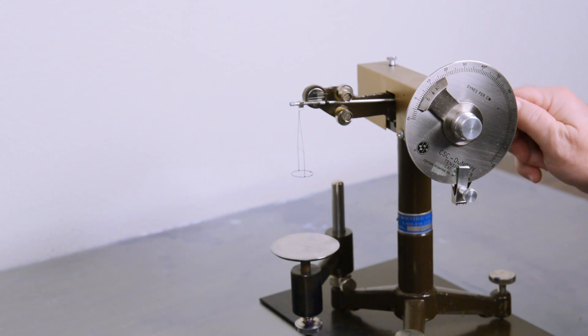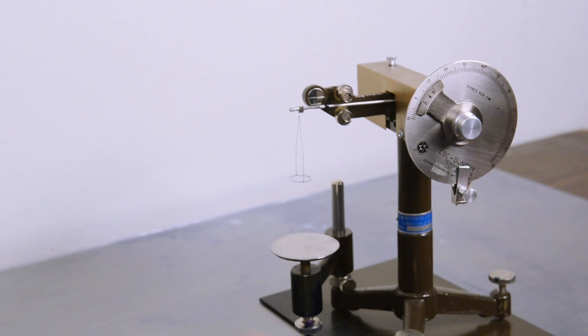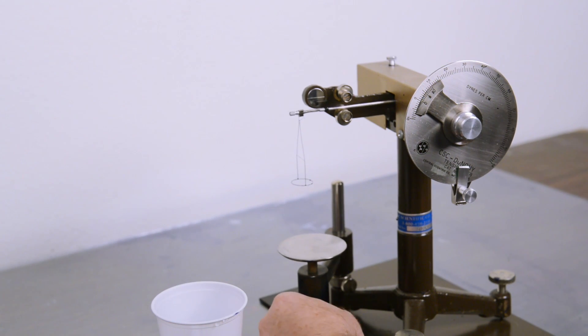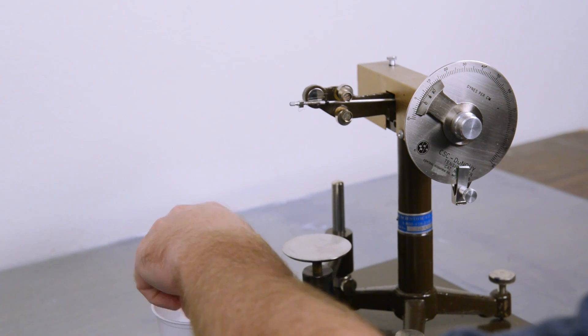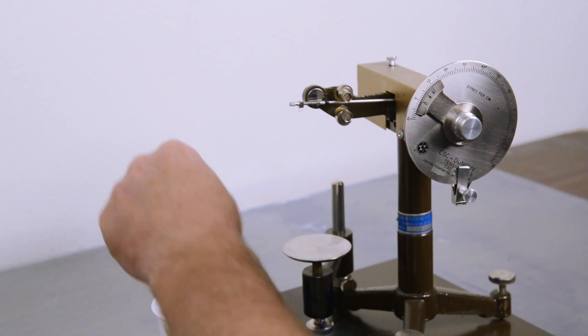We are going to zero out the dial, so zero, zero. Our arm lever is all the way up, and we need to clean the denoy ring.